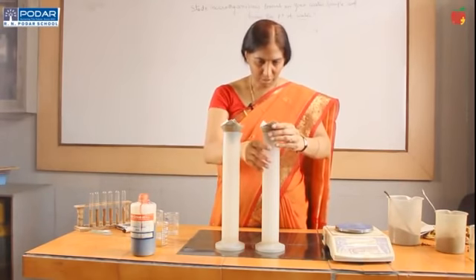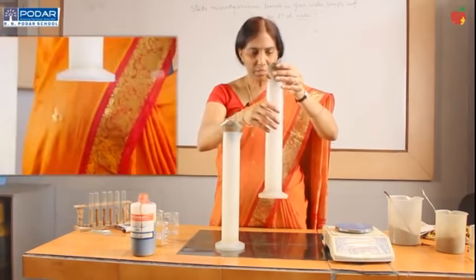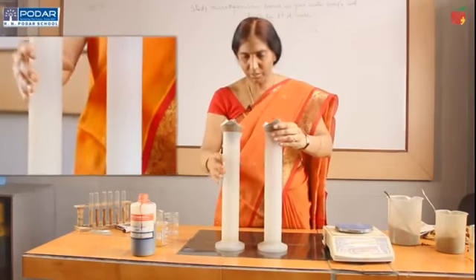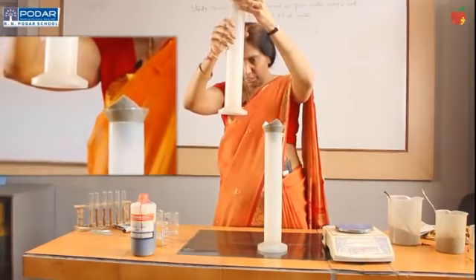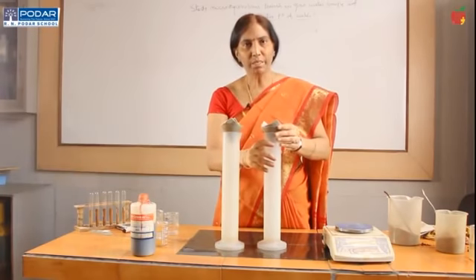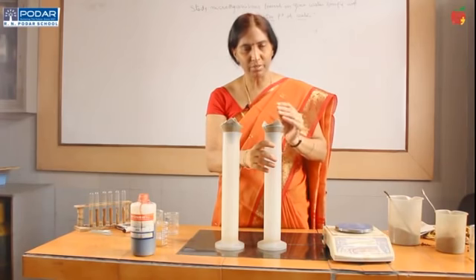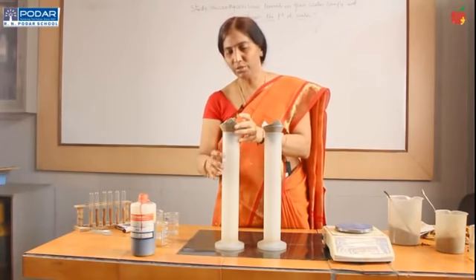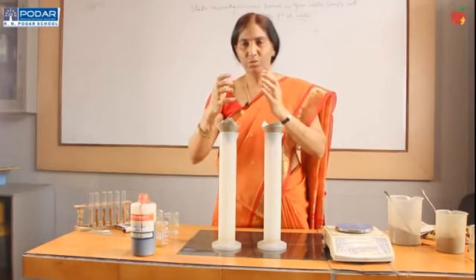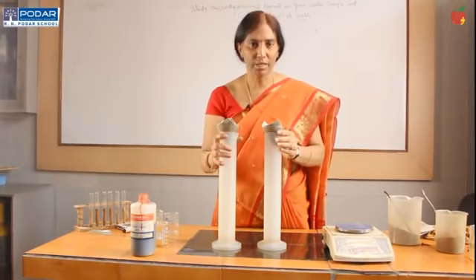Now, let us see the amount of water collected in both the cylinders. The first cylinder, which has garden soil, has 30 ml of water in it, whereas the cylinder having roadside soil has more water, that is 40 ml. That means garden soil has the capacity to hold water. This is because of the porosity of the soil. In garden soil there is no space between the soil molecules because of the humus present in it, whereas in roadside soil, the soil particle size is larger and the inter-soil spaces are also larger. So, whatever water you give is percolating through. That is the reason for the water holding capacity of the garden soil.